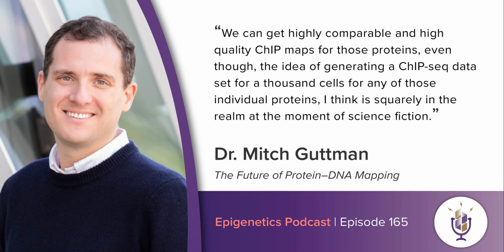So how sensitive is ChIP-DIP to antibody quality? And how did you validate that the method faithfully captures the intended protein-DNA interactions? Right. So there are, I guess, two components to that. The first is the standard issues with antibody quality also apply for ChIP-DIP. You have to have a high-quality antibody to be able to purify the protein.